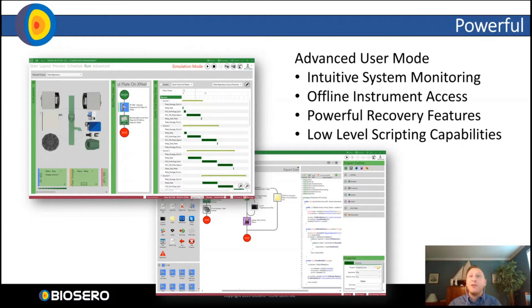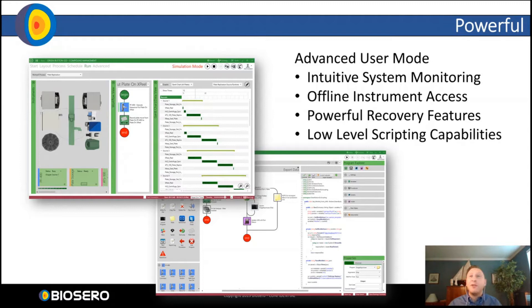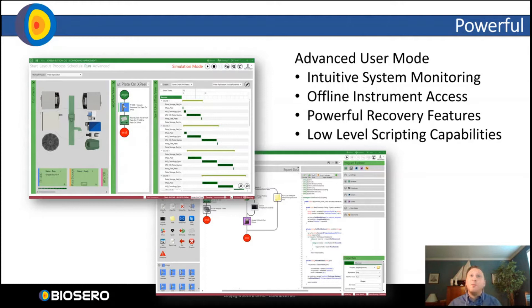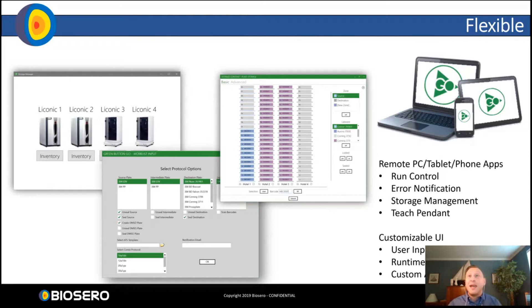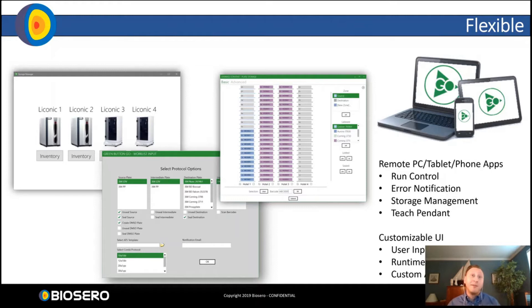Green Button Go also has an advanced user mode that gives the user complete control and power over their system. They can script low-level instrument commands, incorporate C-sharp Python scripting to unlock better data management. We can execute external programs. We can even have the system tweet at users when something goes wrong. What we give our users in the advanced mode is really unlimited. It's almost its own visual programming language to allow you to fully program your automation as you need.